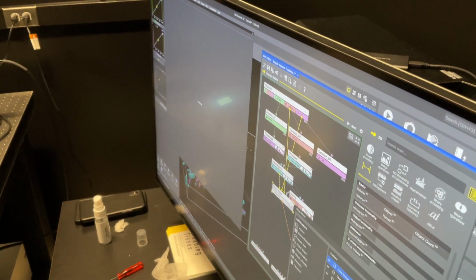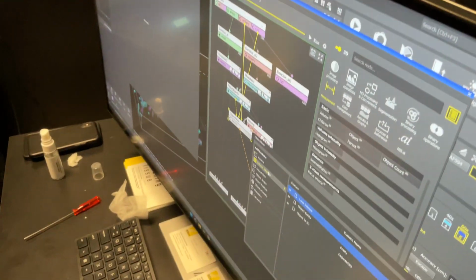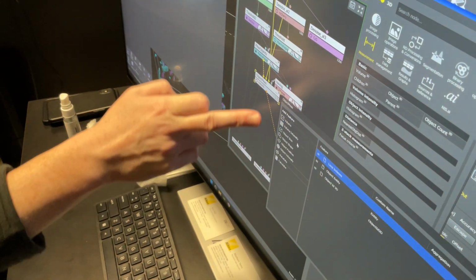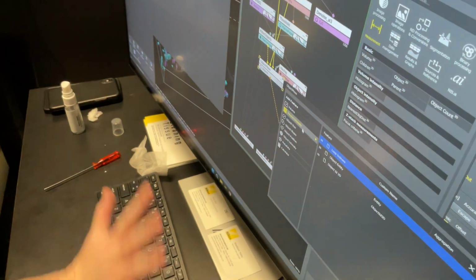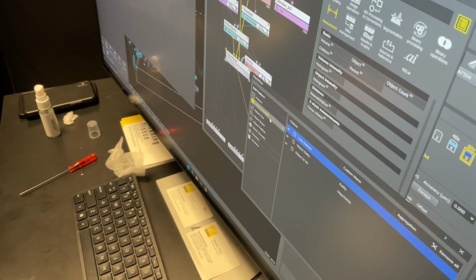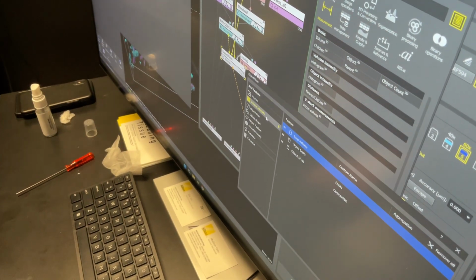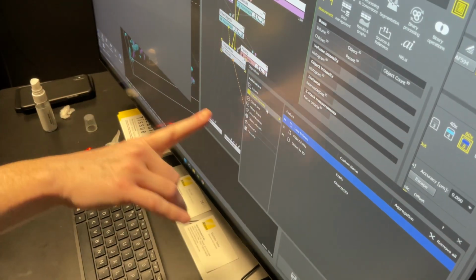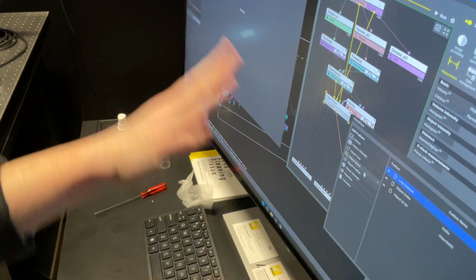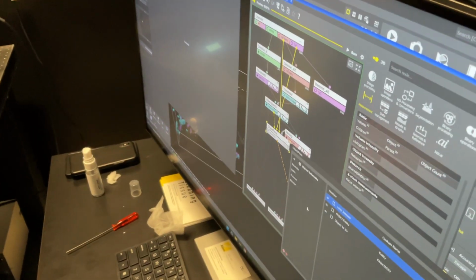So to select the measure, you click on it. That's going to be total field volume. Anything in these top sections is overall, like the aggregation of data for the whole field. Then these are objects. You'll get volume, and this will be like the whole mask. So object intensity.